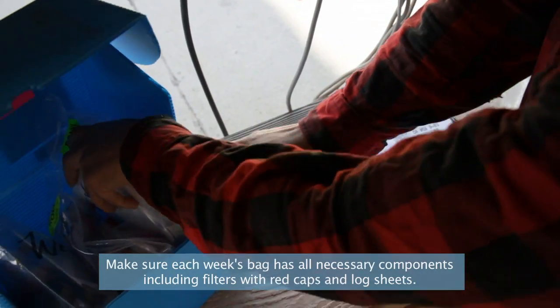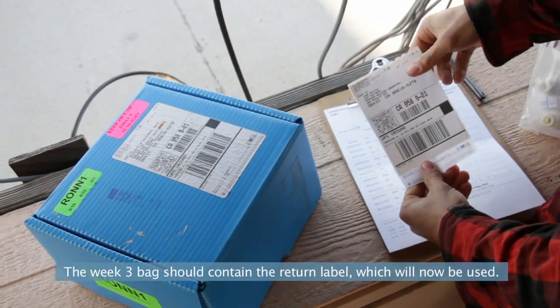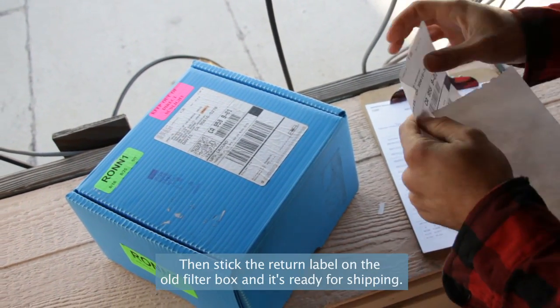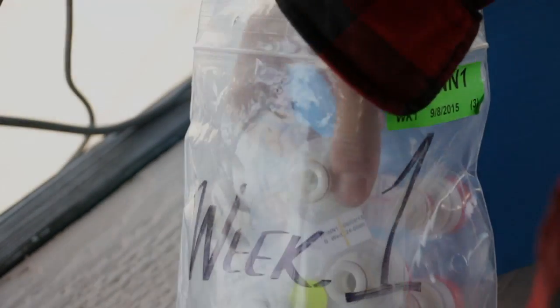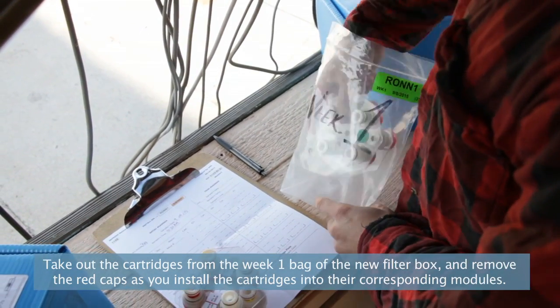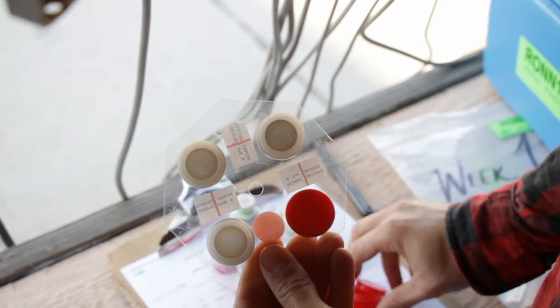Make sure each week's bag has all necessary components, including filters with red caps and log sheets. The week 3 bag should contain the return label, which will now be used. Then stick the return label on the old filter box and it's ready for shipping. Take out the cartridges from the week 1 bag of the new filter box, and remove the red caps as you install the cartridges into their corresponding modules.